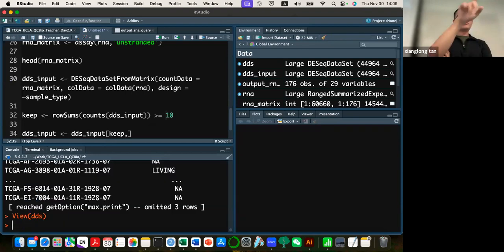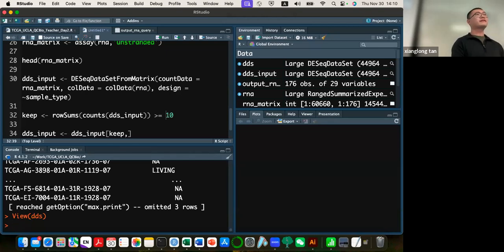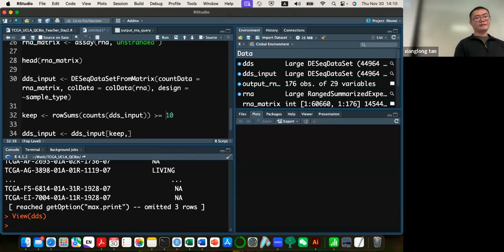It's for which column? Yeah, it's actually the column data in the S4 object. This S4 object actually has a unique parameter called column data. And the column is another object, independent of that column data.